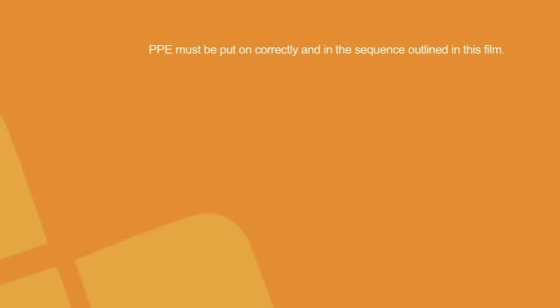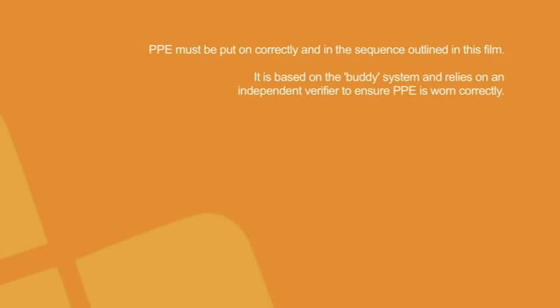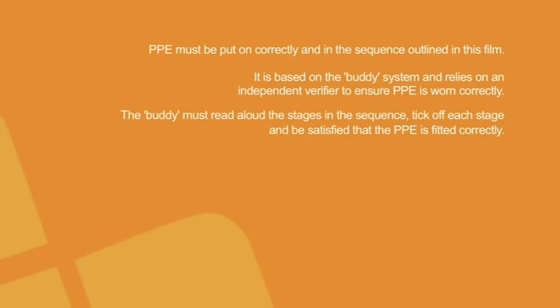PPE must be put on correctly and in the sequence outlined in this film. It is based on the buddy system and relies on an independent verifier to ensure PPE is worn correctly. The buddy must read aloud the stages in the sequence, tick off each stage, and be satisfied that the PPE is worn correctly.